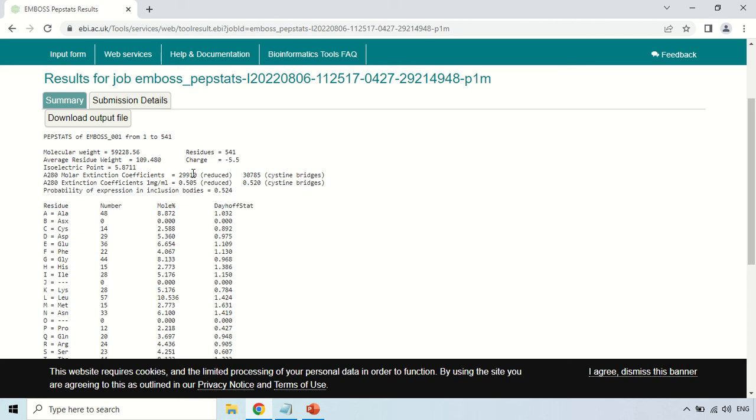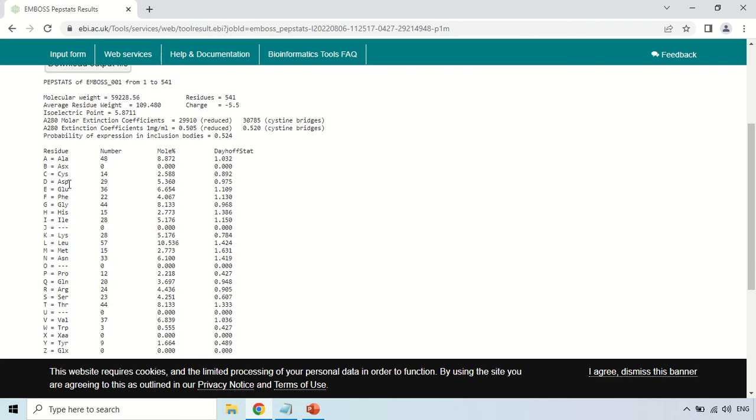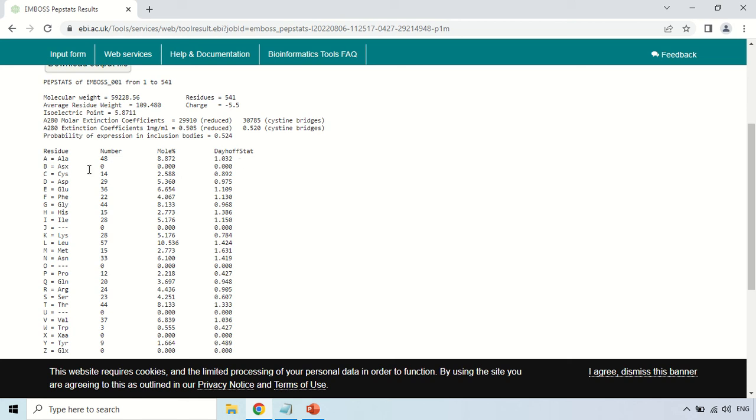Now this is about the amino acid composition of your protein. These are the residues, meaning amino acids. These are their numbers, their molecular percentage, and this is the Dehoff stat. Dehoff stat shows that out of a thousand times how many times a particular amino acid is repeated.